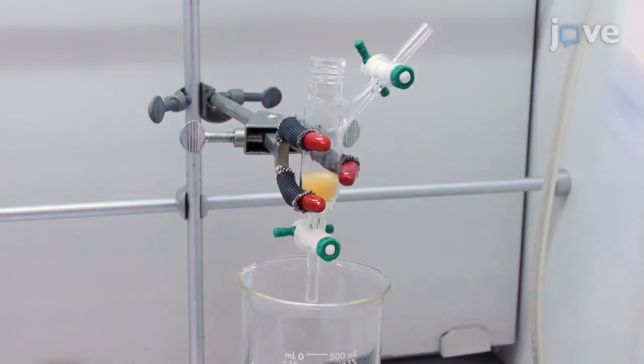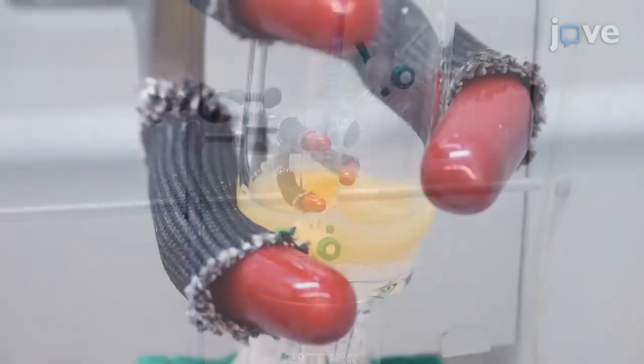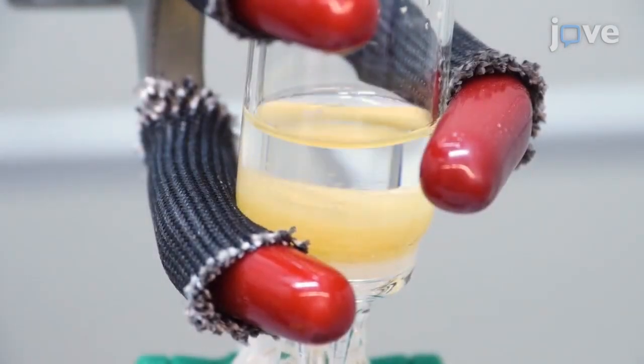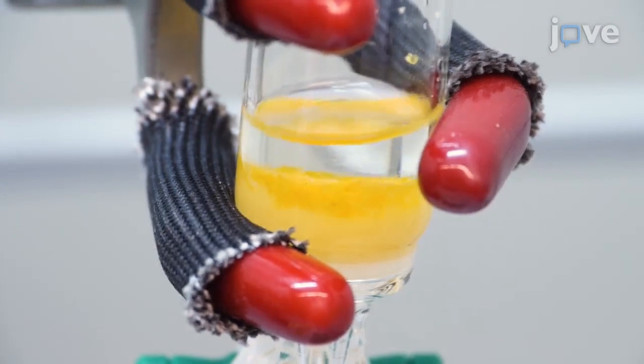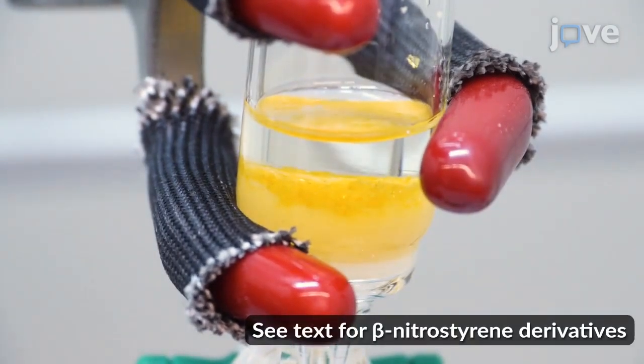Next, in a well-ventilated fume hood, add 1.48 milliliters of triethylamine, 10 milliliters of anhydrous toluene, and 0.637 grams of beta-nitrostyrene to the dry furfurylamine-bearing resin.